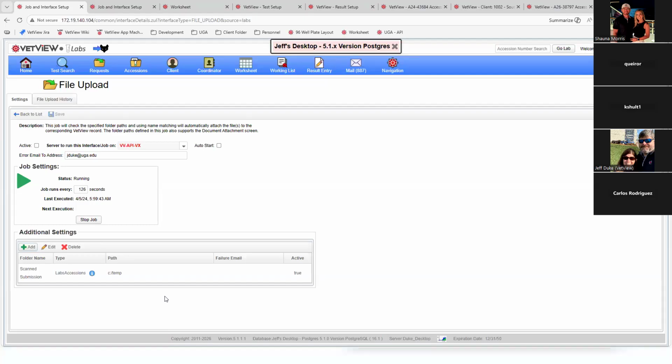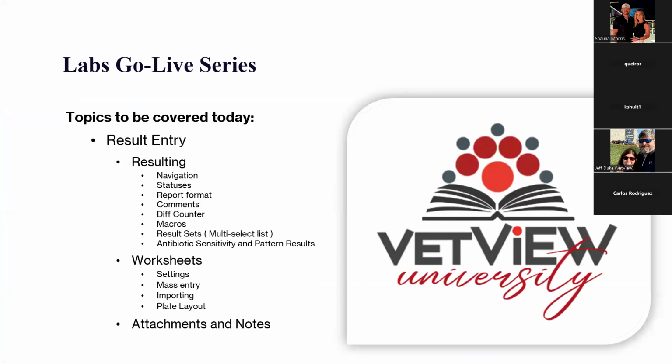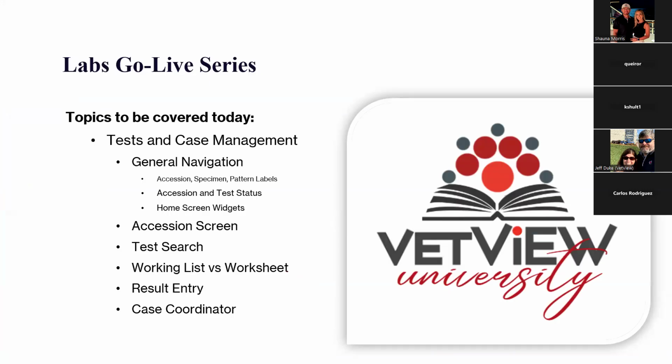So you can just drop things in mass and have it automatically associated to the accession without having to navigate to every single accession one by one, attaching the different files in the system. So that's part of that interfacing, helping you go paperless and also automating some of those mass tasks that you have in the system. All right, so I've gone through the three sections there, quite quickly. I will open for any questions anybody might have on any of the sections today.